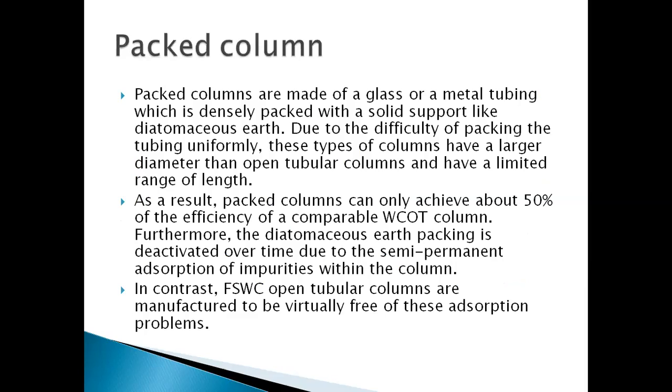Packed columns. Packed columns are made of glass or metal tubing which is densely packed with a solid support like diatomaceous earth, due to the difficulty of packing the tubing uniformly. These types of columns have a larger diameter than an open tubular column and have a limited range of length.